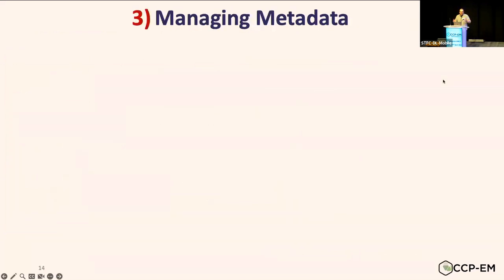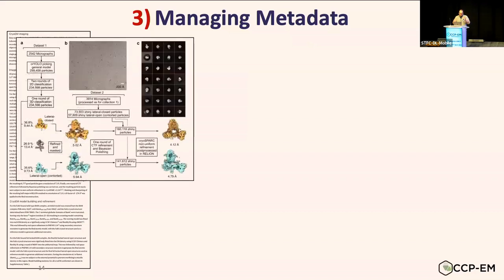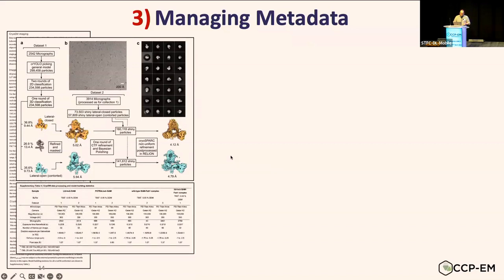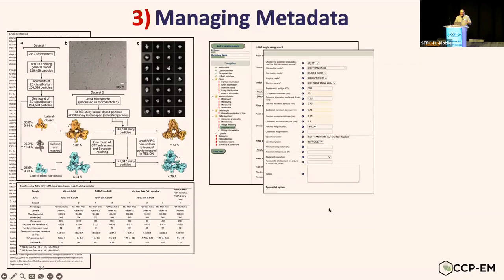The third big thing we want to do with this package of software is provide tools for managing all the data you're producing. So if we step back and think, how do we describe a cryo-EM workflow? You keep a really, really good lab notebook, and then you refer back to your lab notebook and you write a wonderful methods section for your paper. You comb through all the logs of all the programs you ran to get all the information to build some sort of diagrammatic workflow. You probably have some summary tables that have summary data about your results. Then this is generally transcribed into entry forms for the databases by hand.